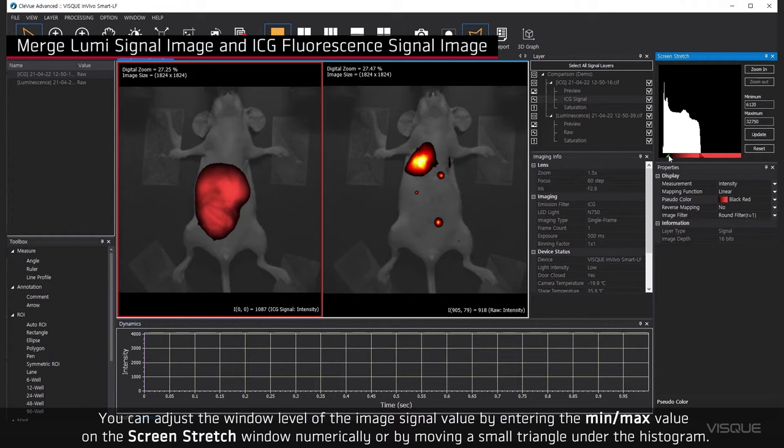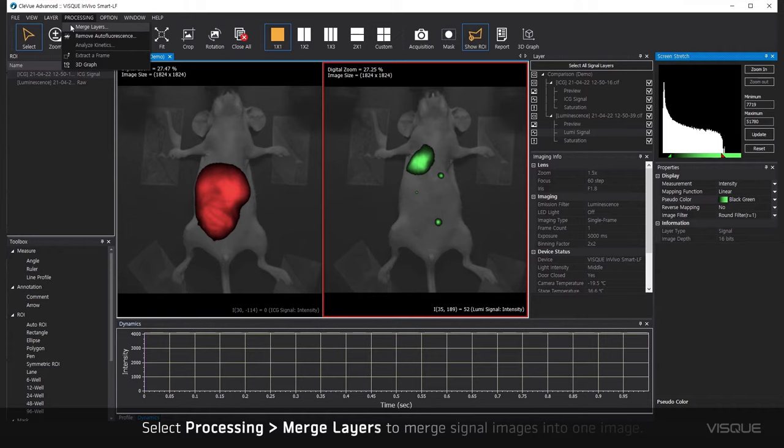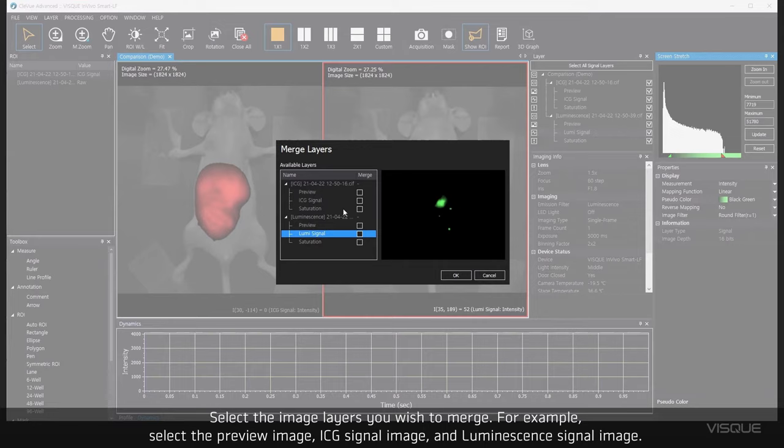Select Processing, then Merge layers to merge signal images into one image. Select the image layers you wish to merge. For example, select a preview image, ICG signal image, and luminescent signal image.